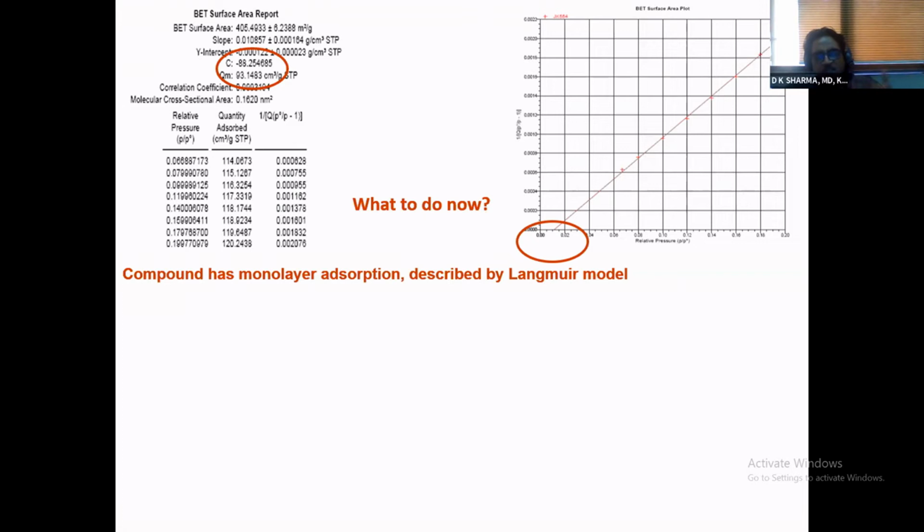They extended the Langmuir theory, included the possibility of multi-layers, and then came out with that equation that I showed you. The beauty of this equation is that from an experiment or from data which has multi-layer formations, it gives you the value of the monolayer capacity. And that is the beauty of the BET equation. From an experiment consisting of multi-layer adsorption, you are determining what the monolayer capacity is. And that's why I said that the BET range should start just before the monolayer is complete.